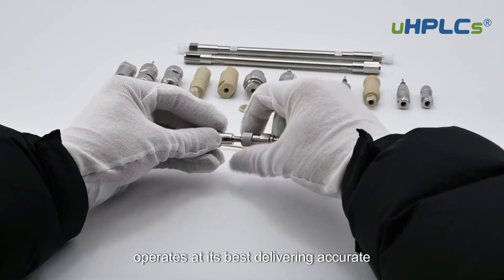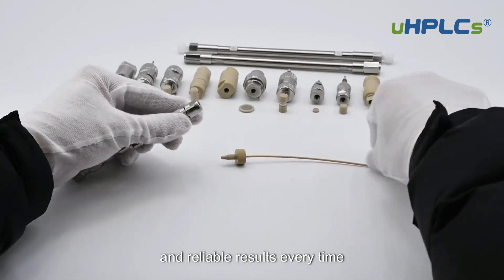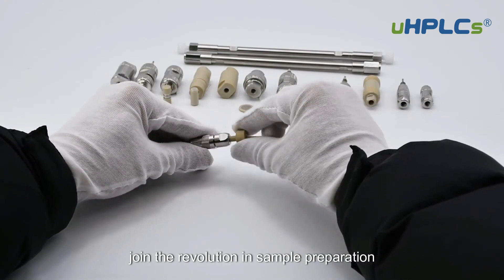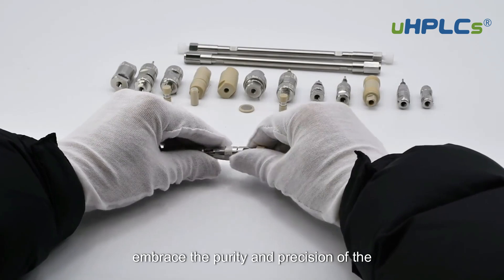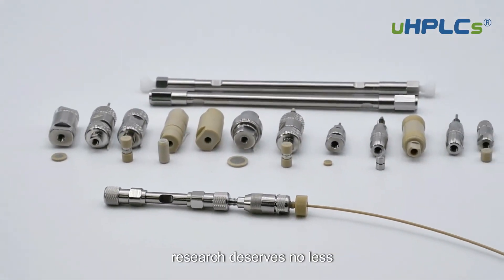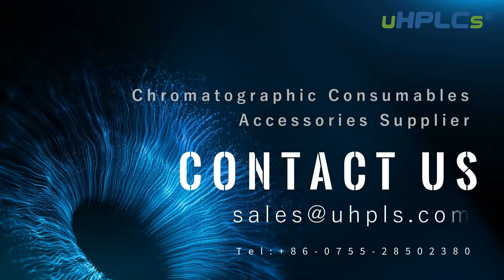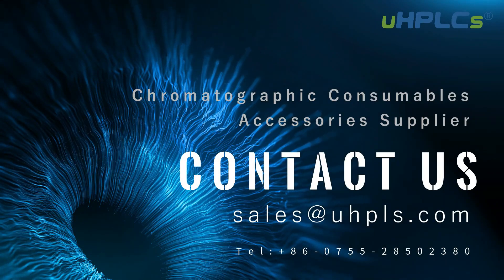Delivering accurate and reliable results every time. Join the revolution in sample preparation — embrace the purity and precision of the Direct Connect HPLC Inline Filter. Your research deserves no less.